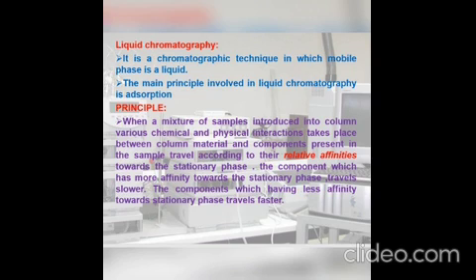It means if the compounds have more affinity to the stationary phase, they will stick to the stationary phase and elute late. If samples have less affinity towards the stationary phase, they will elute fast.